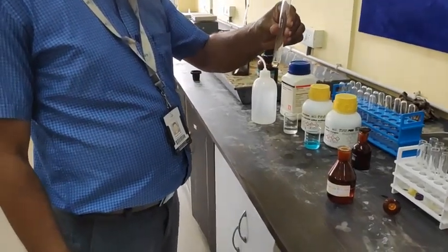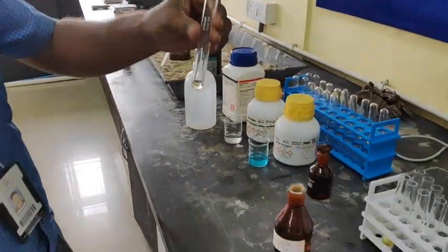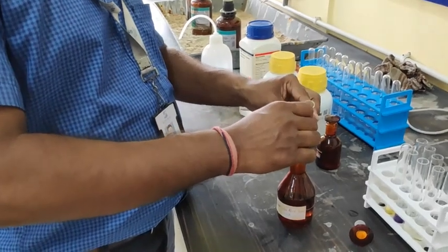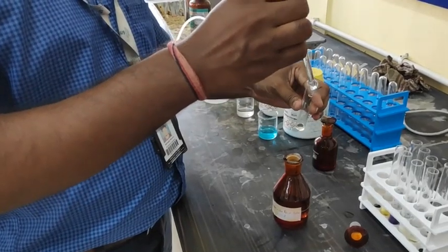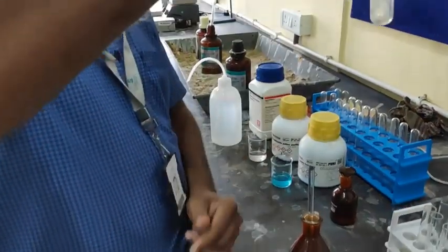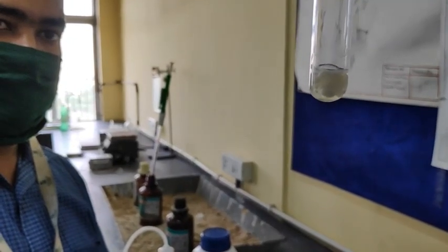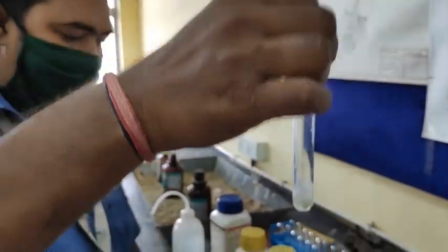So this time we are going to perform the sulfosalicylic acid test. Now this is the protein sample that we have taken here, and this is the sulfosalicylic acid solution. Now let's see what will happen. So he is now adding it drop by drop. Please remember that it has to be added drop-wise, and after that it has to be shaken vigorously. If we observe it very closely, we can already see some kind of precipitation, and we do not even need to observe very closely, it is already present there, how vigorously the precipitation has occurred here.